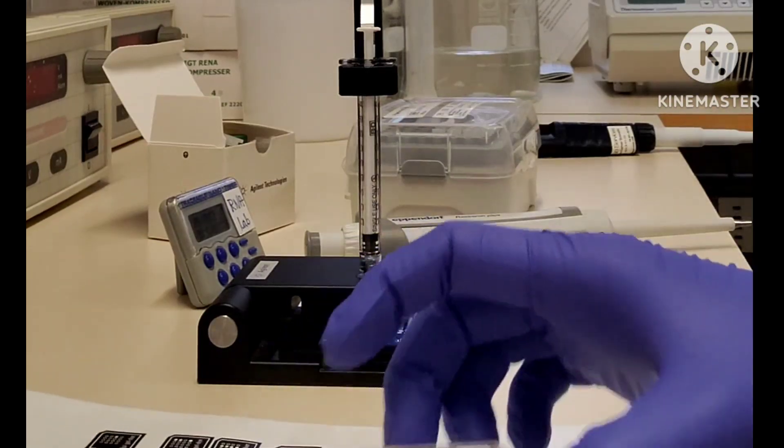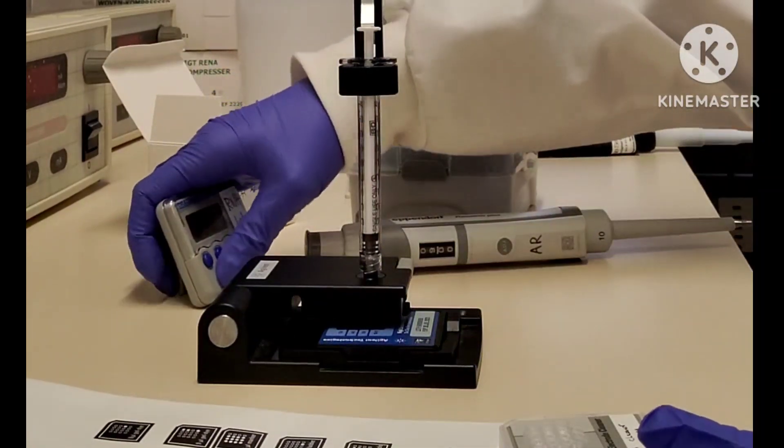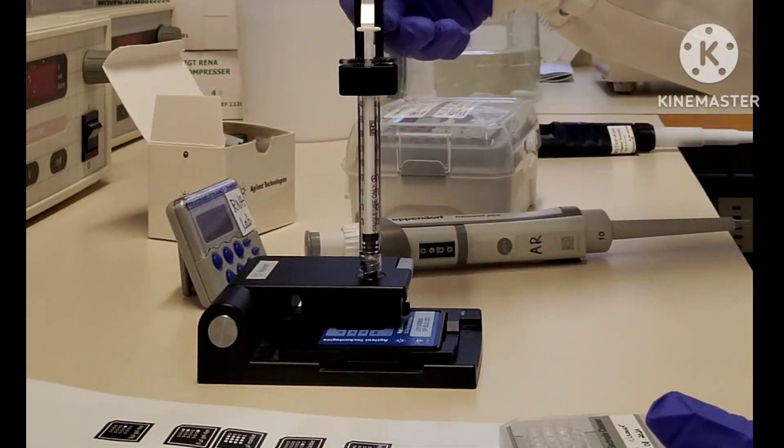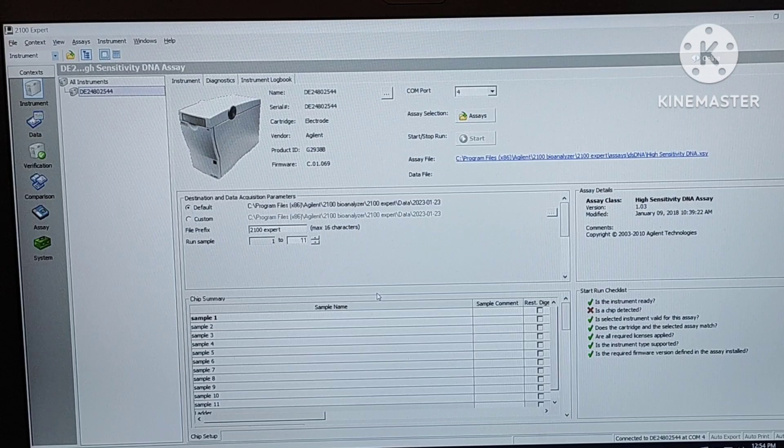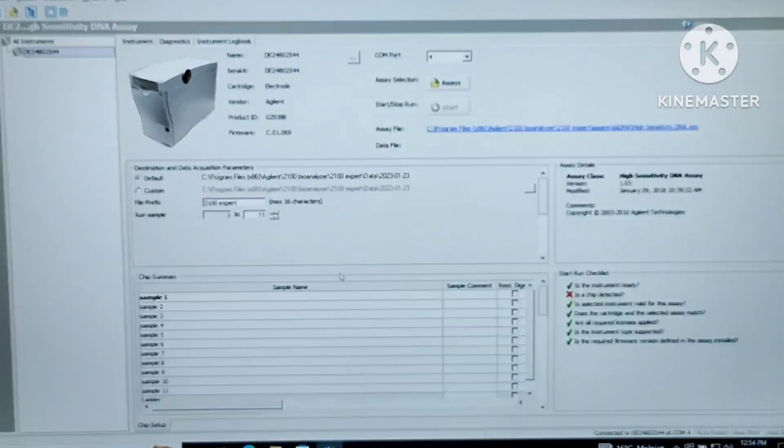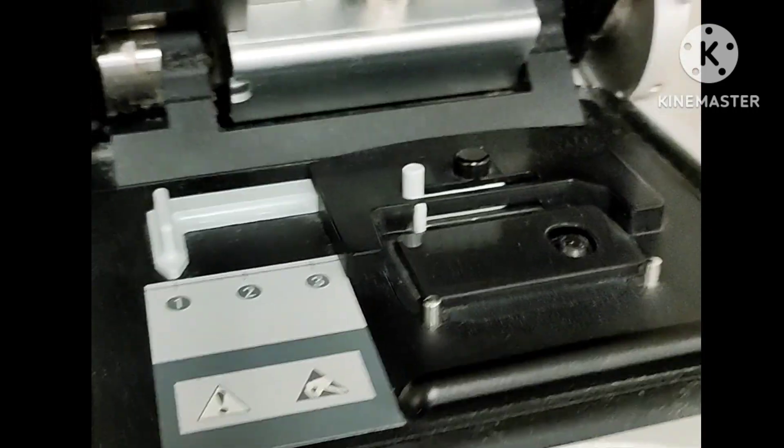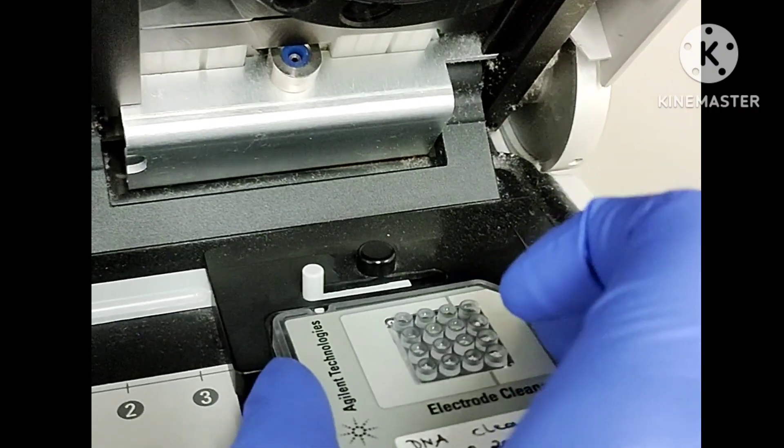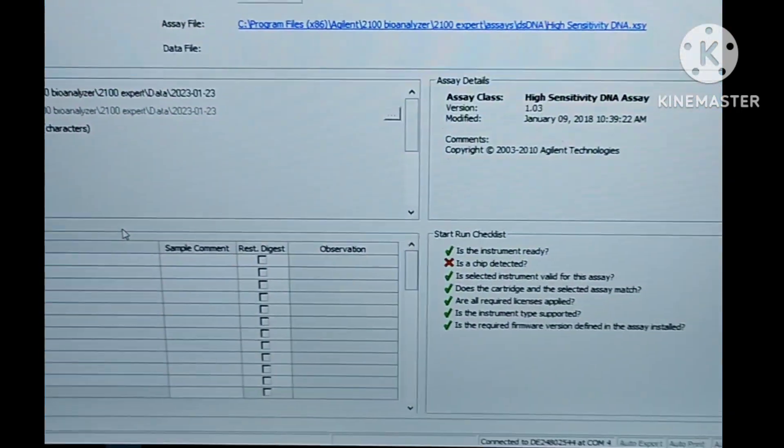Then put it in the bioanalyzer so that the probe will be cleaned by the time you prepare your sample. That's how I basically utilize every minute. After one minute, release the plunger with the clip and wait for at least 30 seconds. In the meantime, we can clean the probe. You can see the chip was not detected yet, and I will keep the chip with nuclease-free water, then close the bioanalyzer. You will see now the bioanalyzer can detect the chip, so it's good to go.